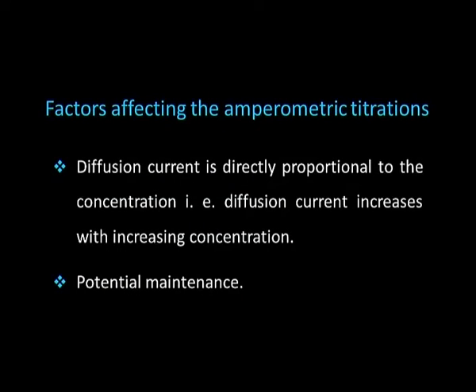However, we require potential maintenance, that is, the potential applied should be constant throughout the experiment. Now, let us come to various types of titration, that is, types of amperometric titration.